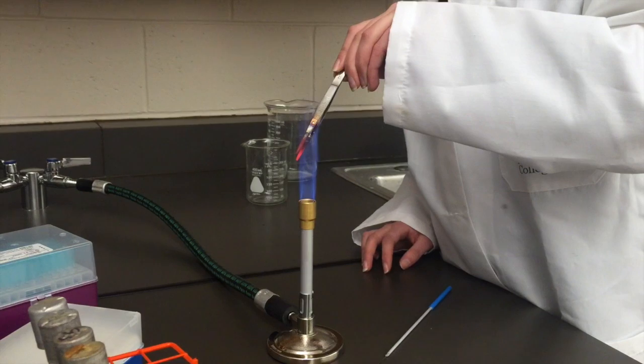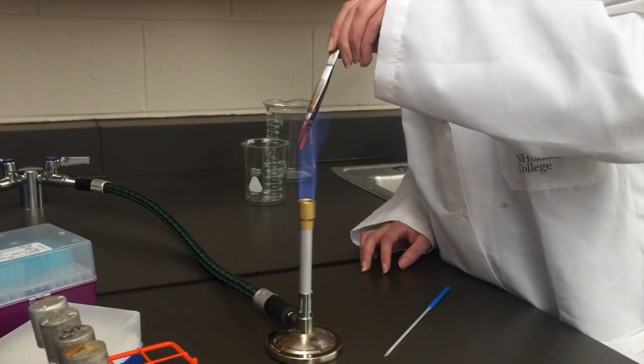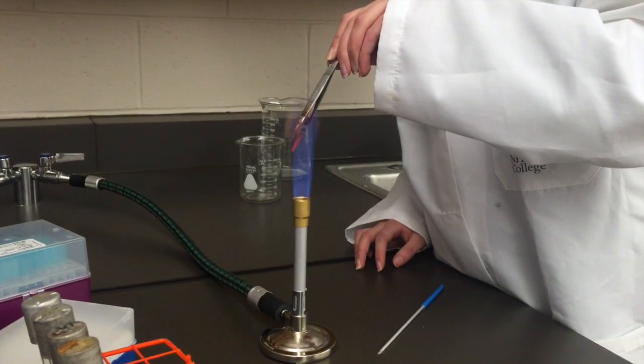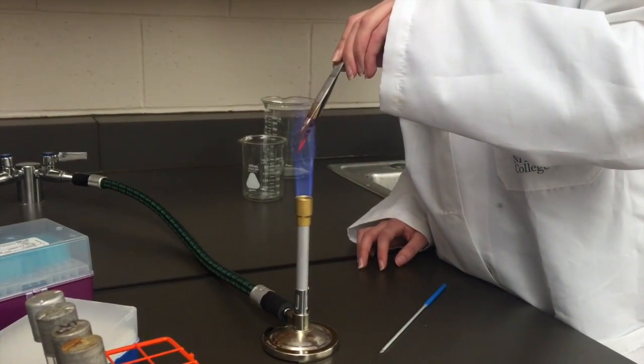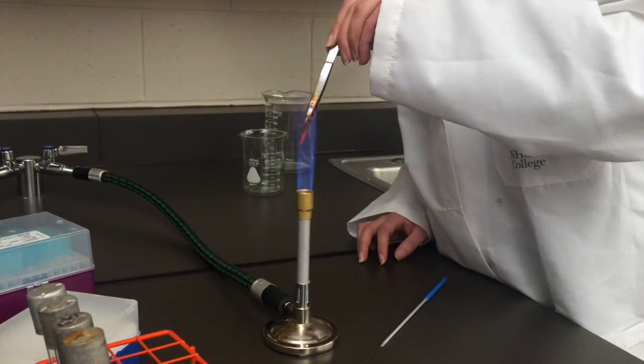Even though this portion of the forceps will not be used to transfer the bead, it will be placed in the media and therefore needs to be sterile. Once the forceps have become red hot, they are now considered sterile and can be used to transfer the plastic bead from the old evolution tube to a new evolution tube.